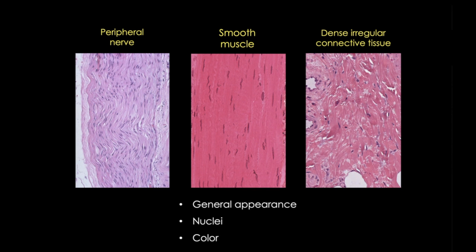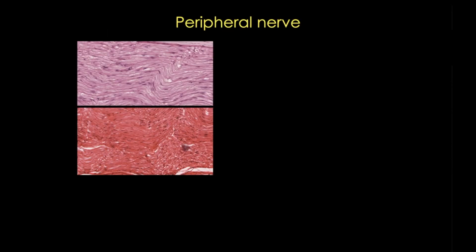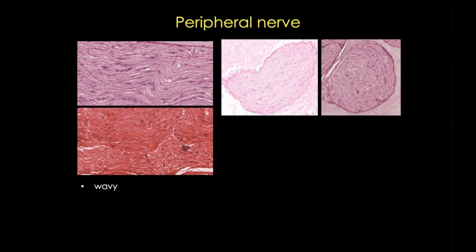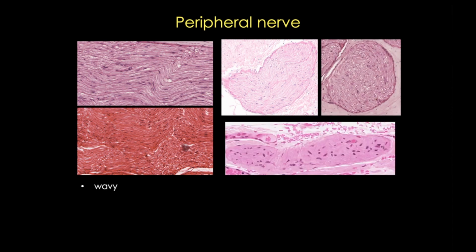So let's start by looking at peripheral nerve. Here are a couple of peripheral nerves cut in longitudinal section. First thing to note is that this nervous tissue is wavy, even in transverse section and in the enteric ganglia. Why wavy? Well, you are looking at a nerve bundle full of individual myelinated axons. The way I think about this is if we took a bunch of electrical cords and bound them somewhat loosely together — they tend to sort of twist together, but they don't exactly line up in perfectly straight lines.